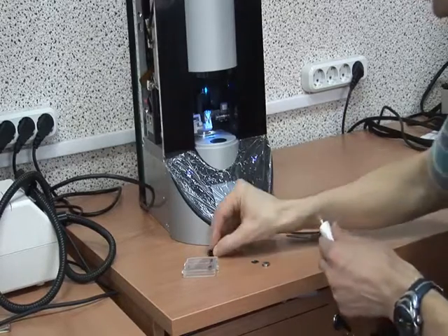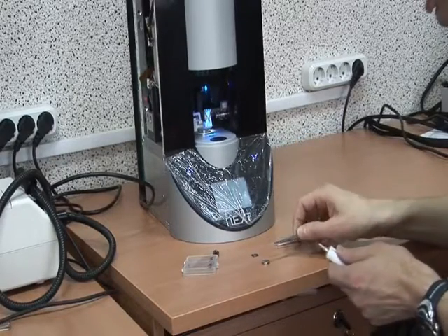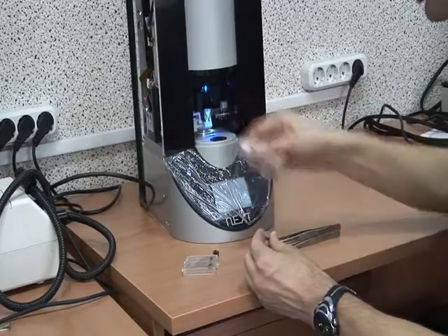Sample preparation. As a sample, I'm using highly-oriented pyrolytic graphite. I fix it via silver paste to have electrical connection with the scanner.